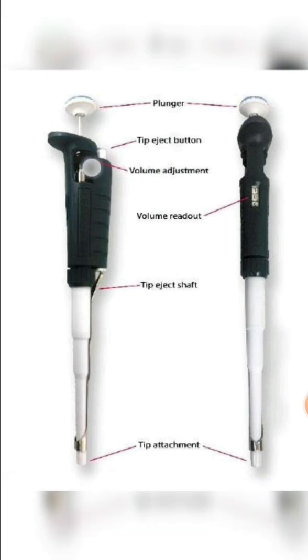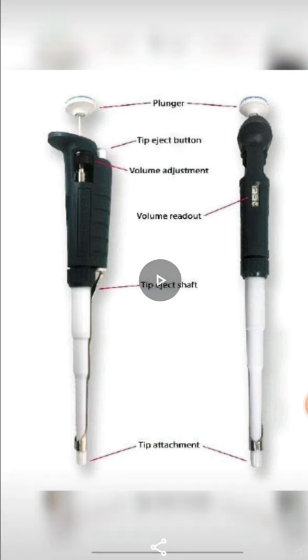The volume adjustment knob is used to set the required amount of volume — meaning what volume we want to transfer. The volume readout is displayed here. For this 1000 microliter pipette, only three digits are shown. The last digit is not displayed, so if it shows '100' it represents 1000 microliters, and if it shows '090' that represents 900 microliters.